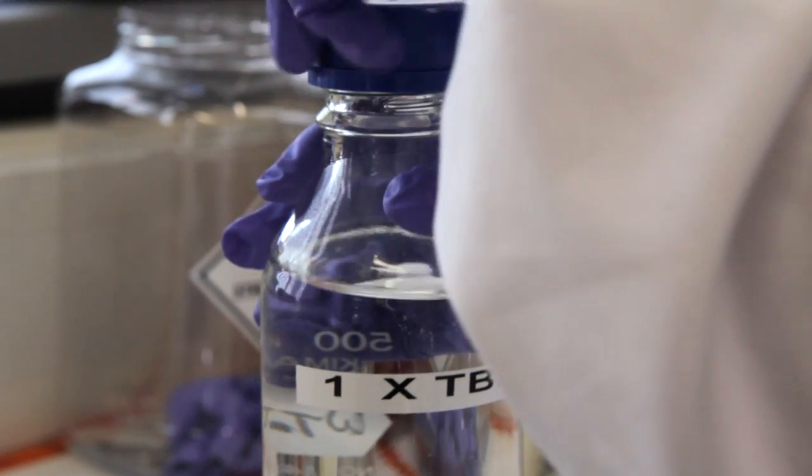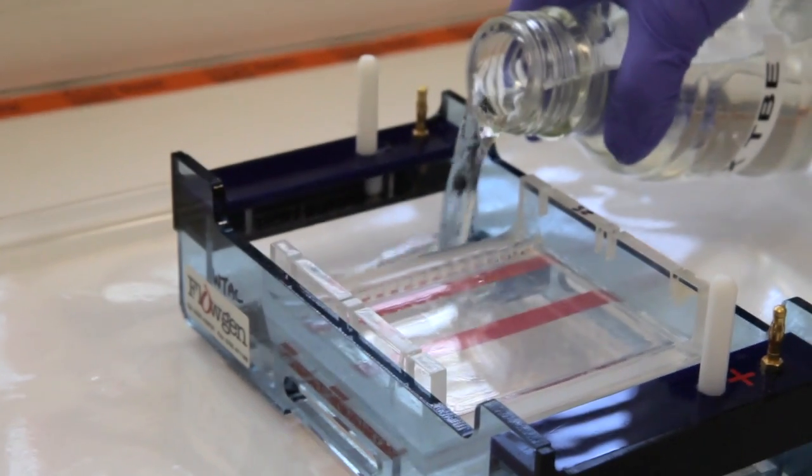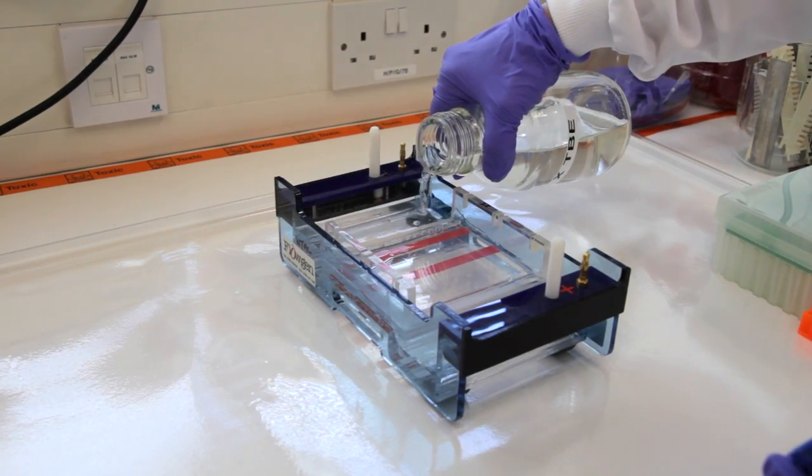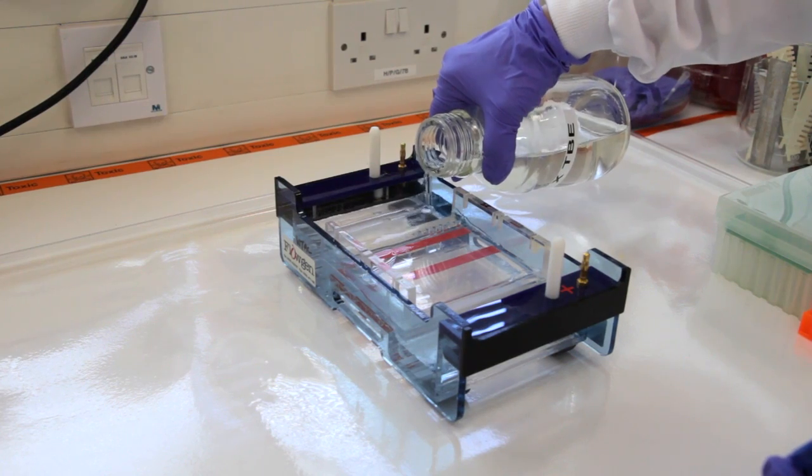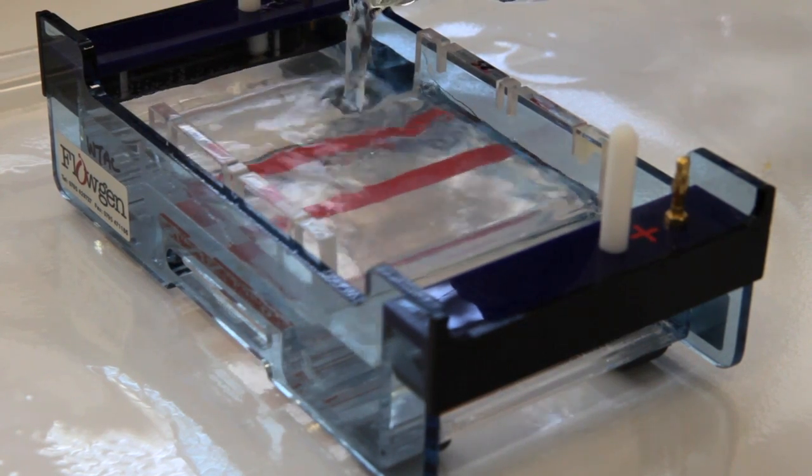You'll need running buffer at the same concentration that you used to make the gel. If you used 1x TBE in the gel then use 1x TBE running buffer. If you use 0.5x TBE to make up the gel then use 0.5x TBE running buffer.